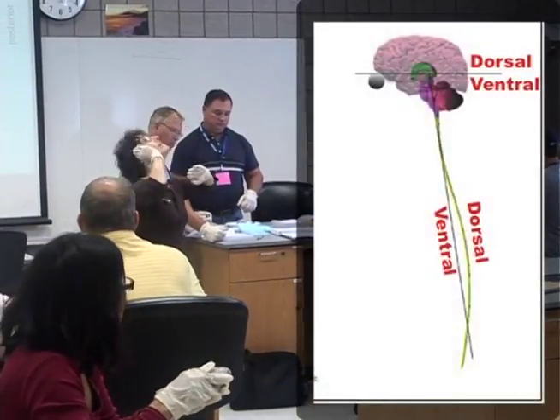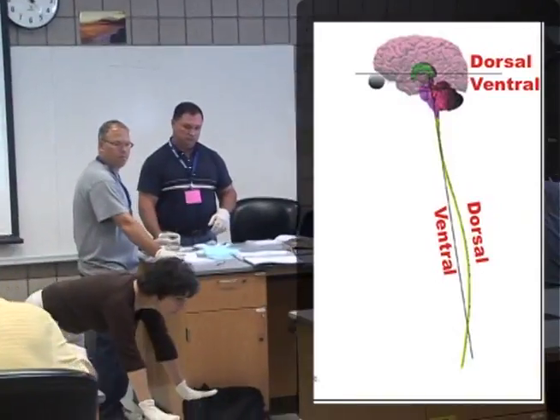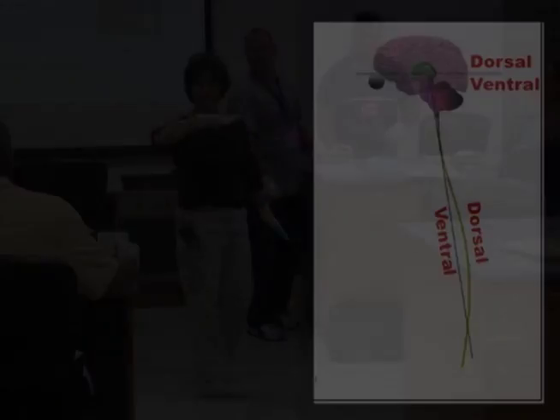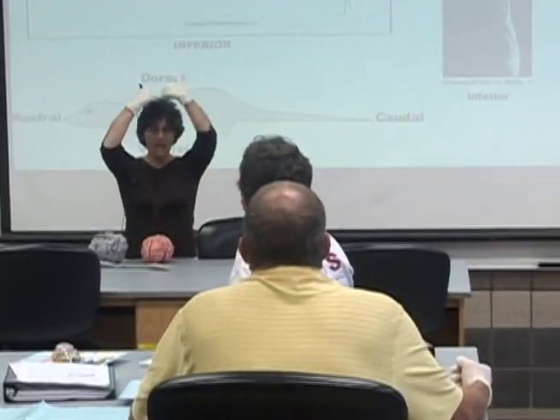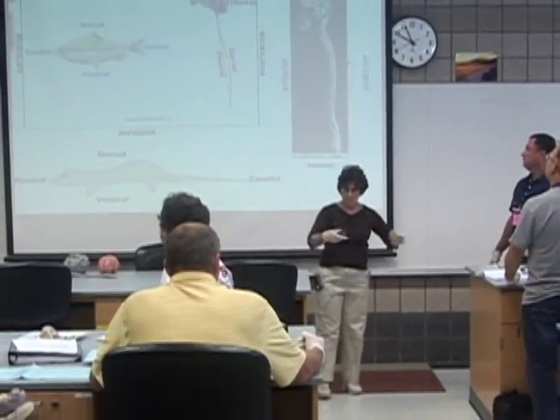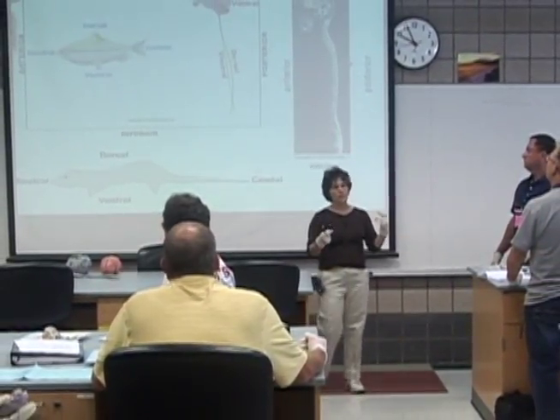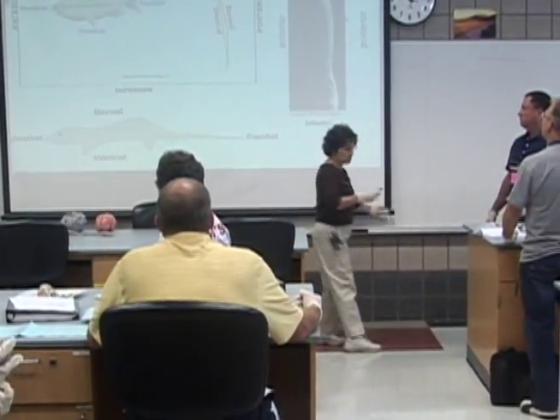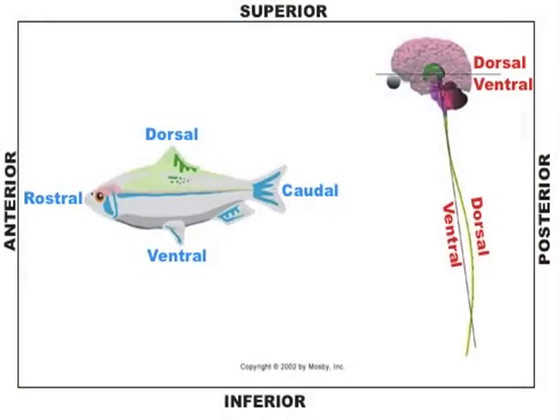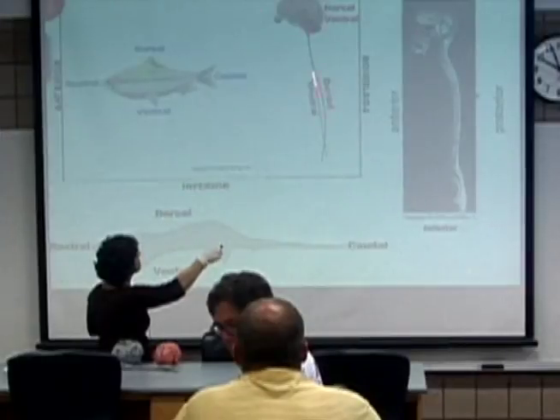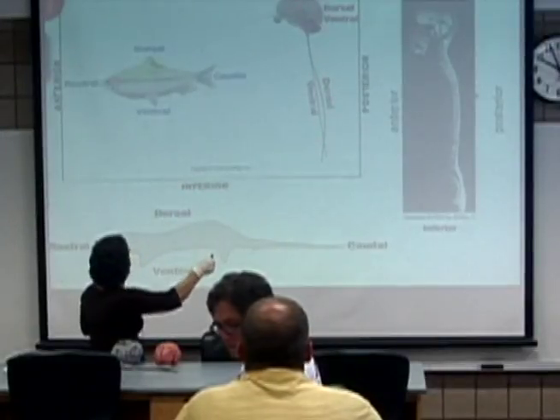For the head, you have to think of this as a four-legged animal — this becomes dorsal, and this becomes ventral. You've got medial down the middle and lateral to the edges. You can see the right angle turn from the two-legged to four-legged axis.